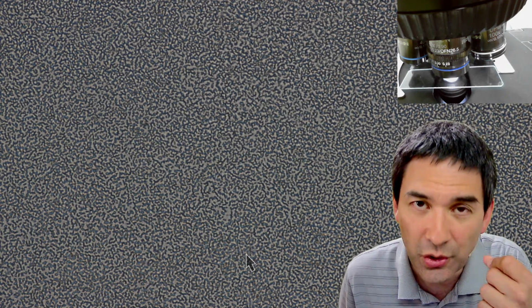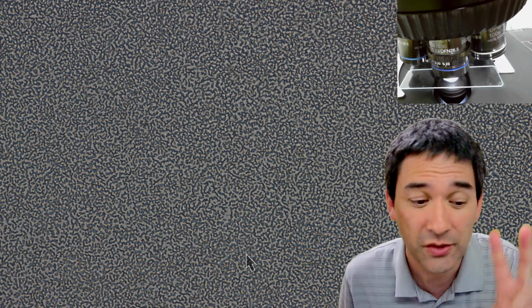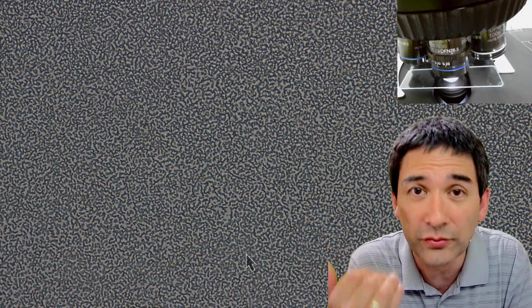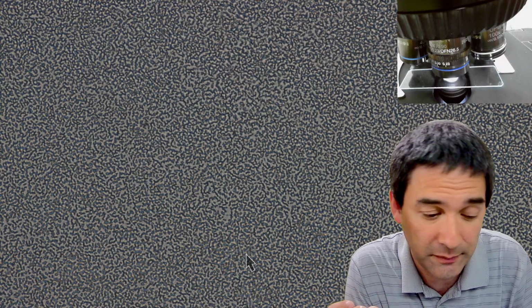As soon as you start working with unknown bacteria, you already need a permit for the lab, and you're in elevated category number 2. As soon as you start making fingerprints, or putting stuff on the plates where you don't know what it is, you are already in an elevated biohazard category. And you shouldn't do that.